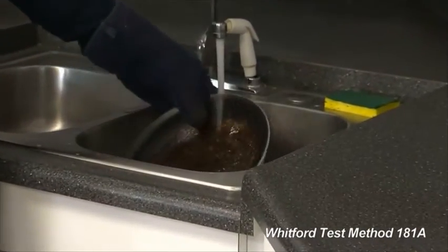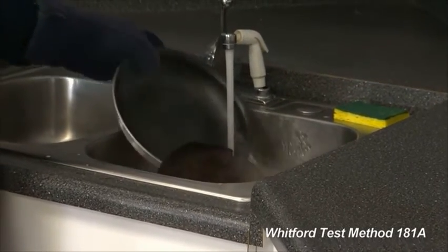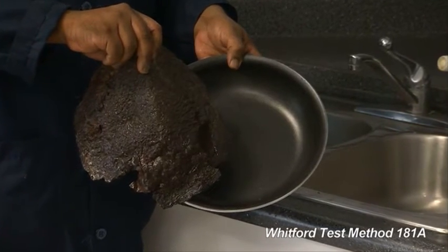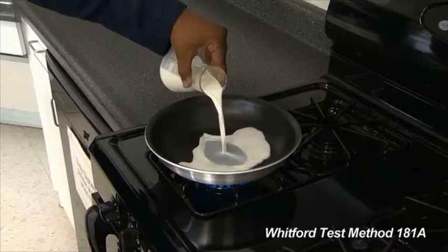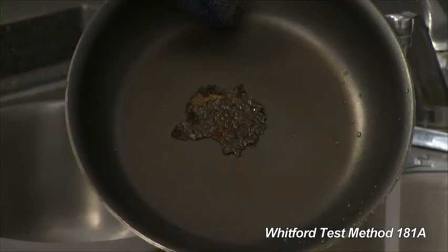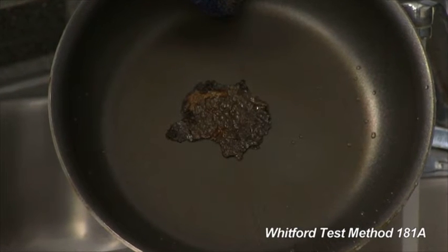Scrape any remaining residue off with a non-abrasive soft sponge. If the residue is easily removed with a wet sponge, that is one passed cycle. Repeat the test as many times as necessary until the residue sticks, at which point the coating fails and the test is over.